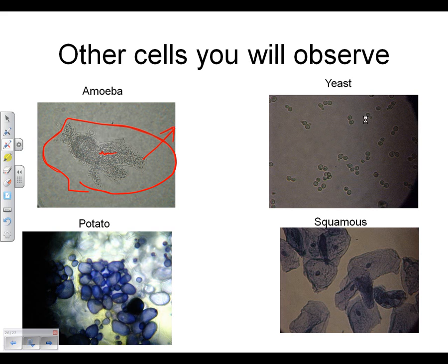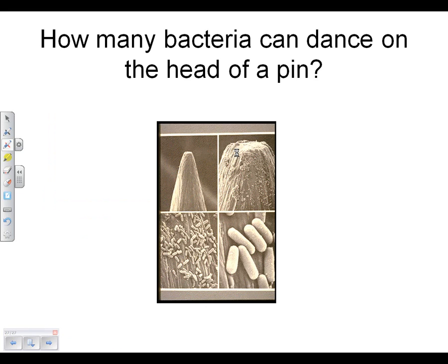And the things we're going to be looking at: here's a yeast that doesn't have any budding. So you see that it's just a plain sphere. And what you're going to be counting are ones like this one that have this little tiny bud coming off the side. See, like all these ones. So we can talk about in lab what you think is budding and what not. Right?